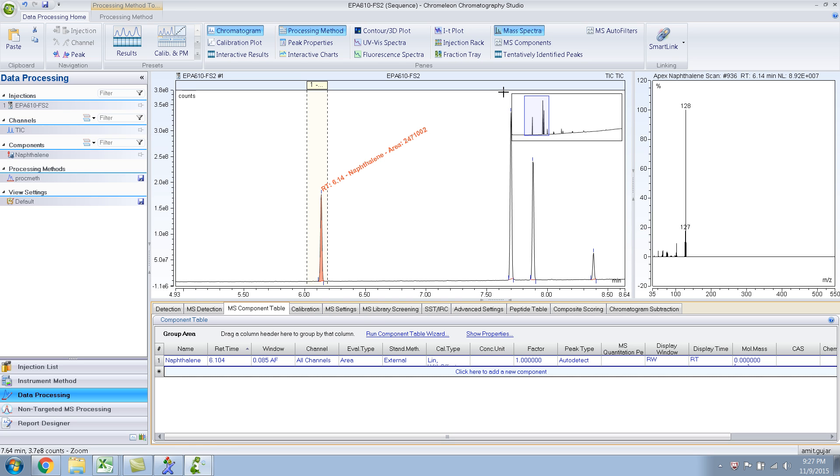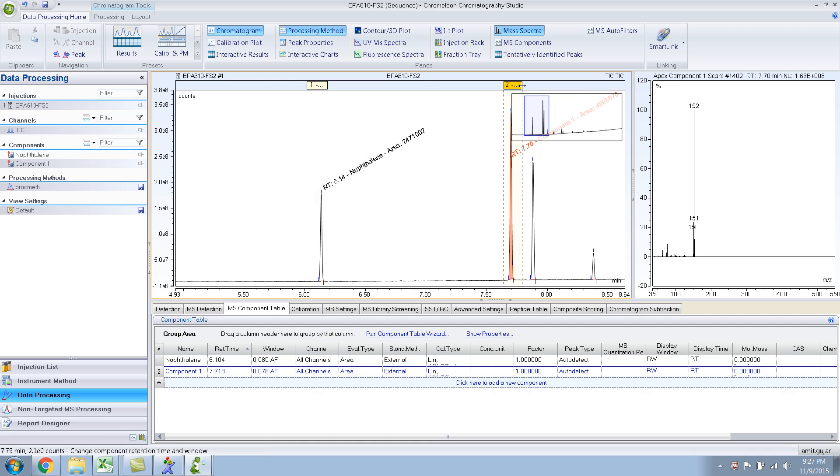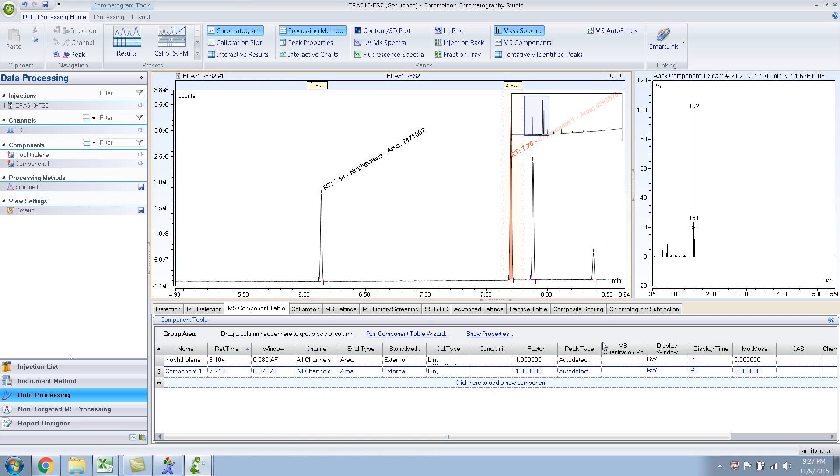So similarly, you do it for the other compound. So the peaks. And you type in your name.